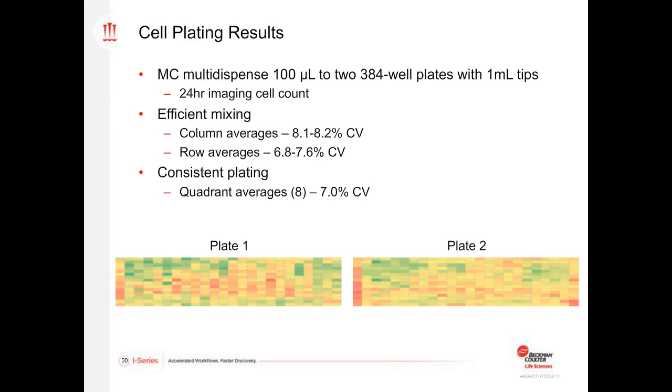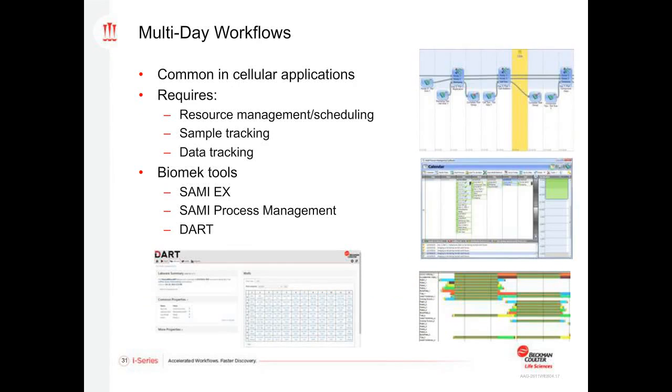Another consideration that we touched on earlier is multi-day workflows. For example, we've just plated our 96 or 384 well plates. How long do these plates need to incubate? Is there an additional treatment? How long until we assay them? These things all have to be taken into consideration because very rarely is this a single day approach.